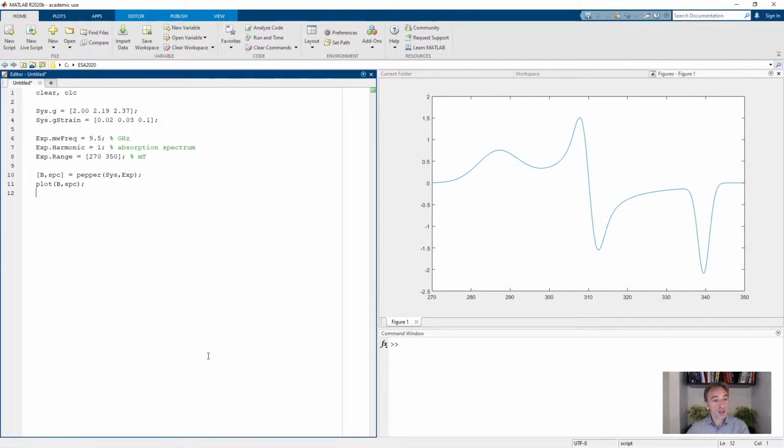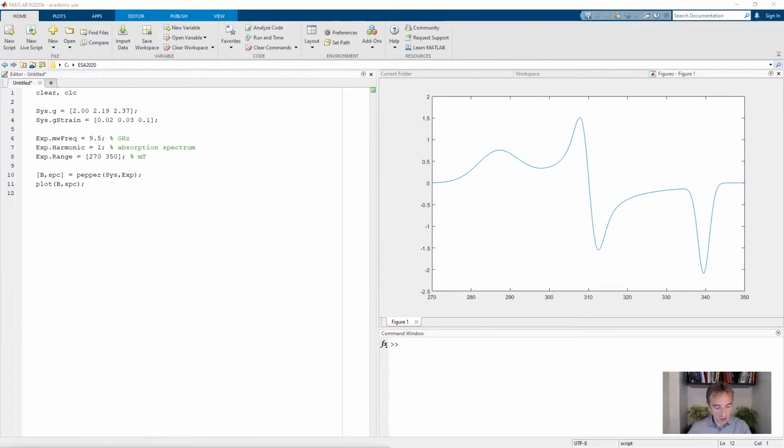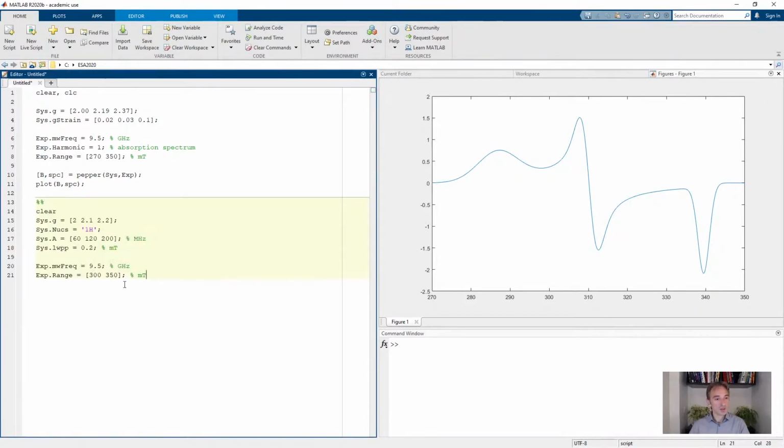Next, an important thing for solid states are tensor frames. Okay, so let's take a simple example. I'm going to just pick something I've prepared. It is a rhombic G tensor, spin 1/2, coupled to one proton, and the hyperfine coupling is rhombic, so three different principal values and large: 60, 120, and 200 megahertz. And we just use convolutional broadening. Let's go back to that simple phenomenological broadening.